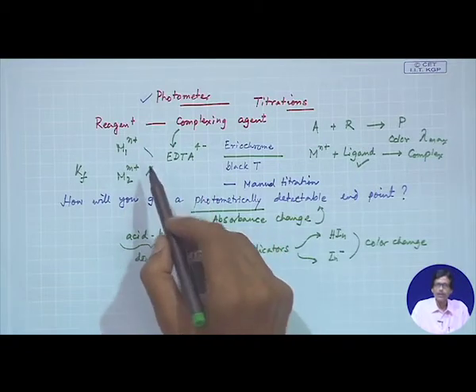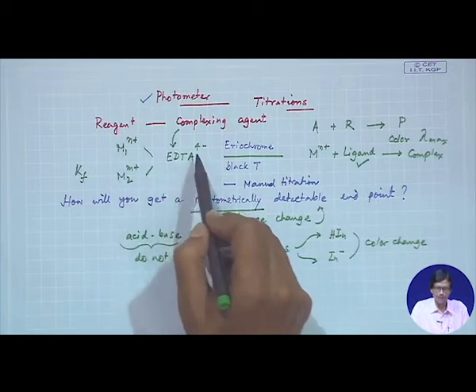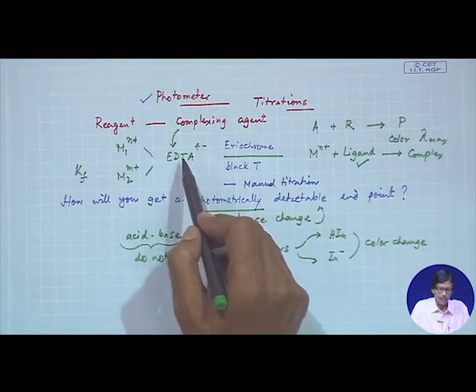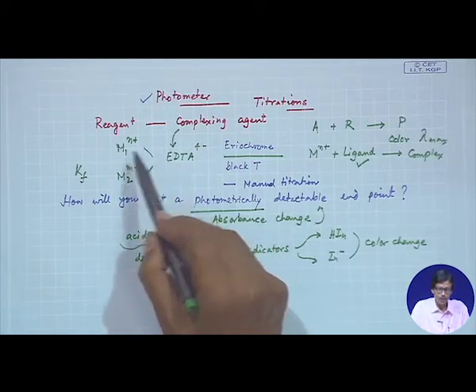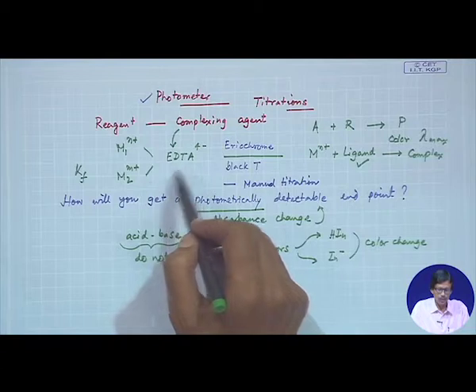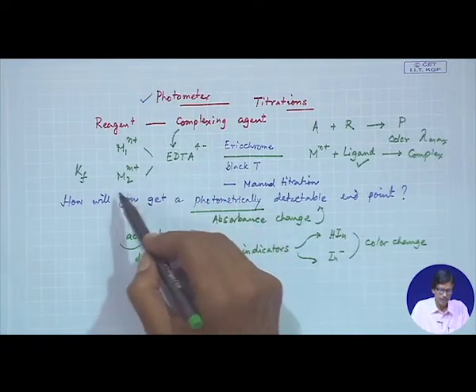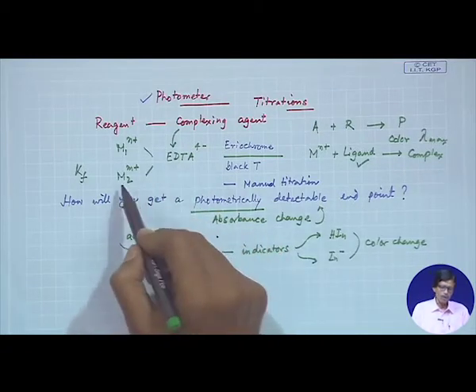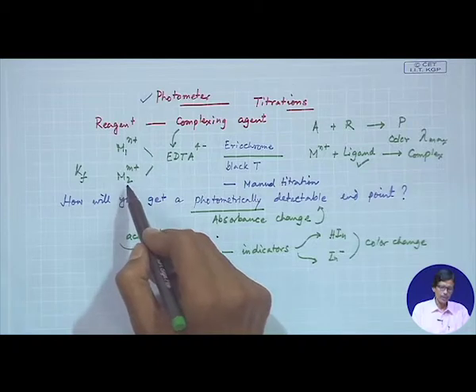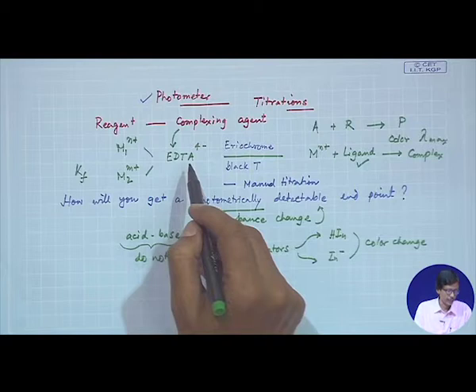absorbances. But if it is not, what happens is that when all the M1 is exhausted, during that time the M2 will not bind to your EDTA. So, when all the M1 is exhausted, at the endpoint of that particular case, your absorbance will change or will increase, going into the titration where the M2 is being consumed by your tetraanionic EDTA.